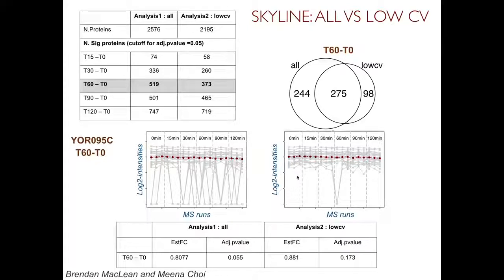And so this is the one which will be truncated with MSstats and will be viewed as censored in MSstats most likely. So that's the idea. Again, we don't know what actually happens because it's a biological experiment, but just from our thought about the biology, this looks more plausible to me than this type of jagged pattern.